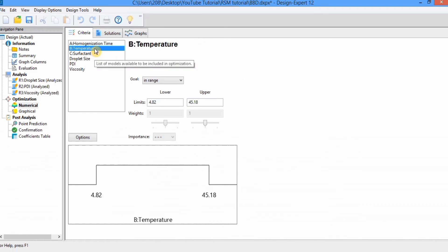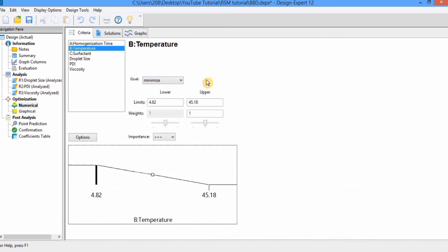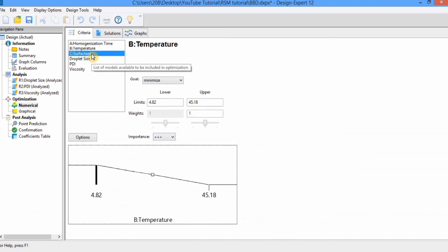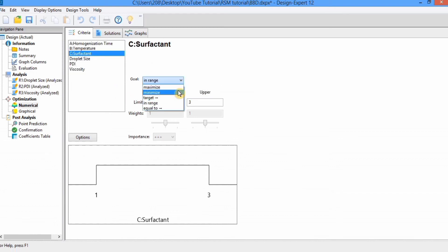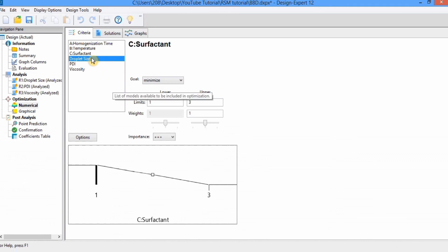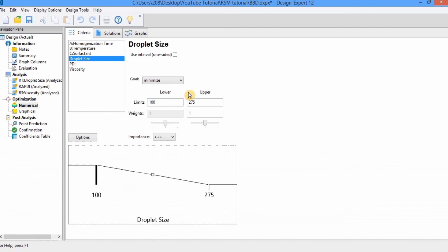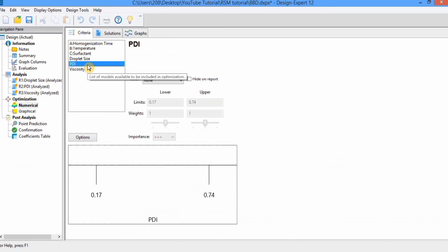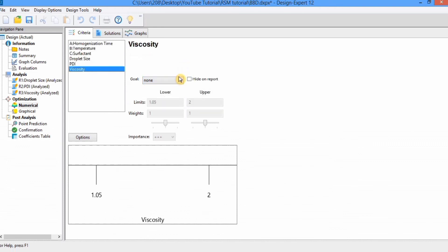Next is temperature — I also want to minimize it, with importance set to 3 stars. Next is surfactant — I also want to minimize it. For droplet size, I want the minimum value, so I select minimize. I will not repeat the settings explanation for each variable. I want minimum polydispersity index and minimum viscosity.